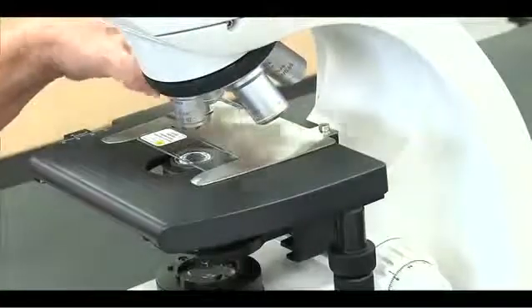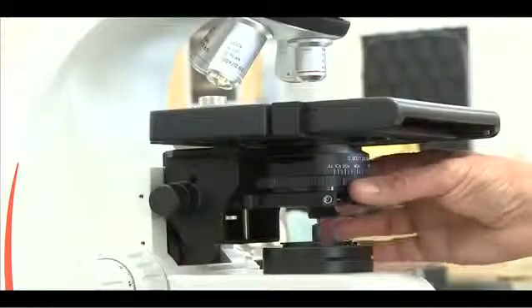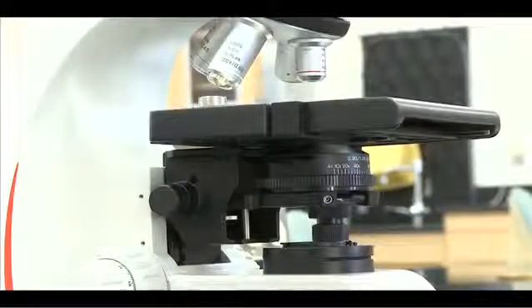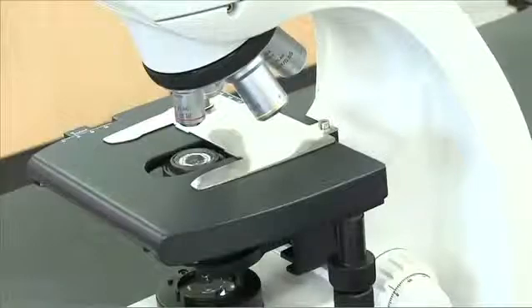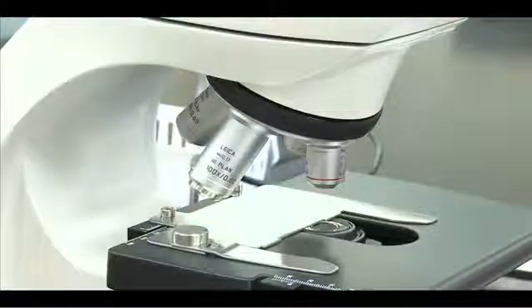To correctly put your microscope away, rotate the 4x objective back into position and set the diaphragm ring to 4x. Gently remove your slide and return it to the tray. Never remove a slide unless the 4x objective is in place.